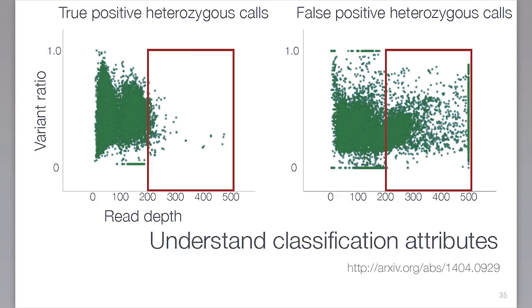Where it gets interesting is when you take the classifier and start asking, what was the most important metric that made you decide this one is likely a false positive? One thing that comes up is that for heterozygous calls, in many cases where you have too many independent observations of that event, it's a false positive. It intuitively doesn't make sense. You think, wait, hang on a minute, I've got 200 observations, but you only expect 30 observations across your genome on average, and you're 2 or 3 standard deviations out from there, then something is wrong with the genome build in that position. It's probably something where our genome build isn't very good, where we have multiple genes in different places. It just tells you something is wrong.